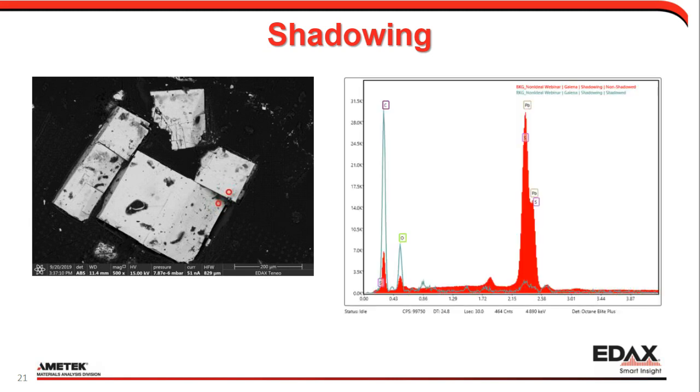We look at the spectrum from these 2 spots. The outlined line is from the lower spot. We see the background in the low energy range is very low. That's due to the low energy X-rays being subject to strong absorption by the piece that is bumped up. We also see higher carbon and oxygen peaks than the non-shadowed spot. This is due to fluorescence.